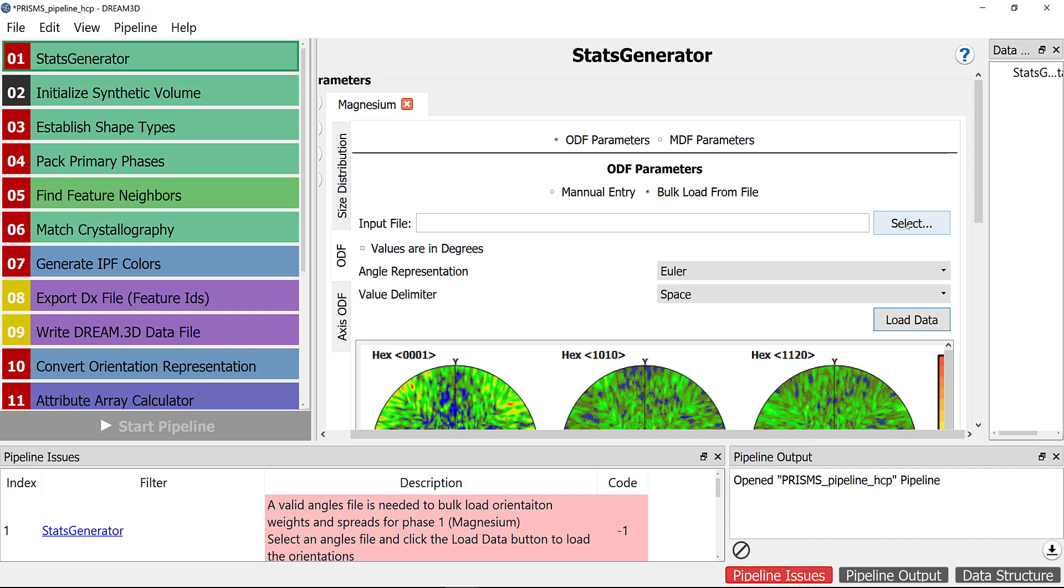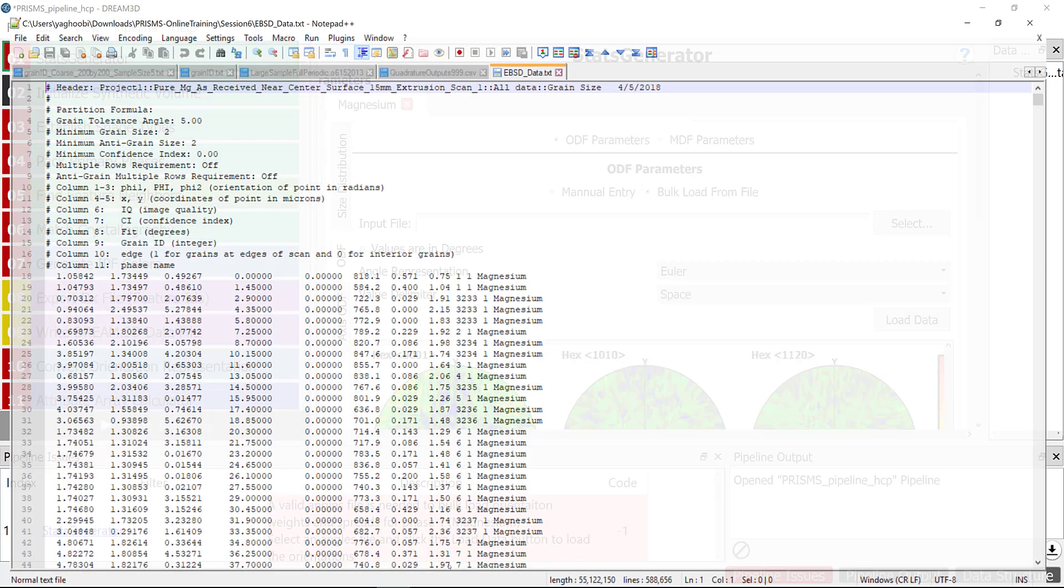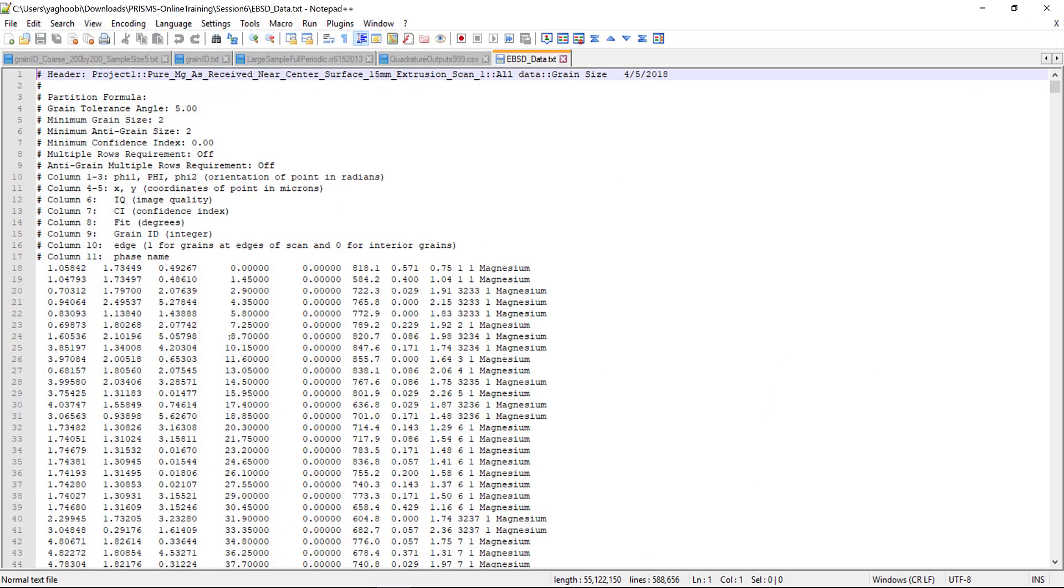We are going to explain what those modifications are. Let's open our EBSD file using a text editor. In our case, we are using Notepad++. This is how our EBSD file looks like. It's basically information for each point including the orientation, X and Y, phase name, grain ID, etc.